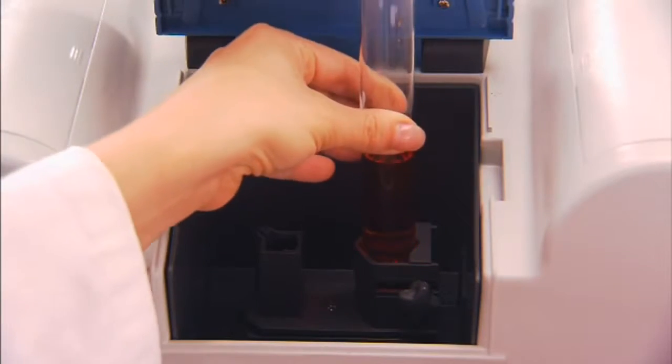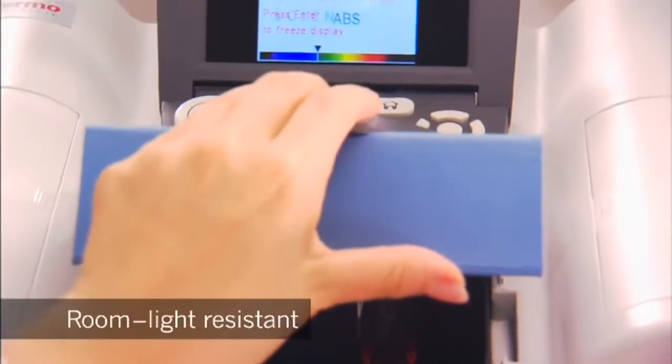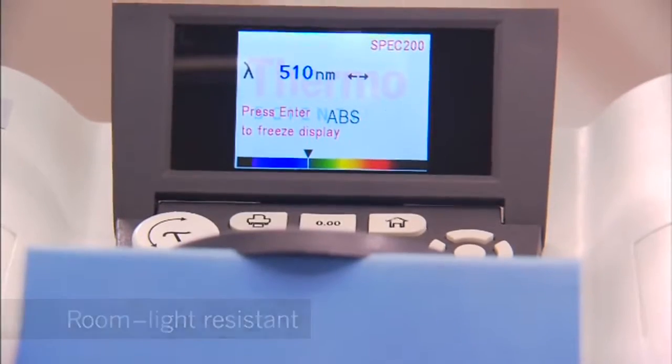Even tall test tubes aren't a problem because the SPEC 200 is room light resistant. It can measure accurately with the lid open.